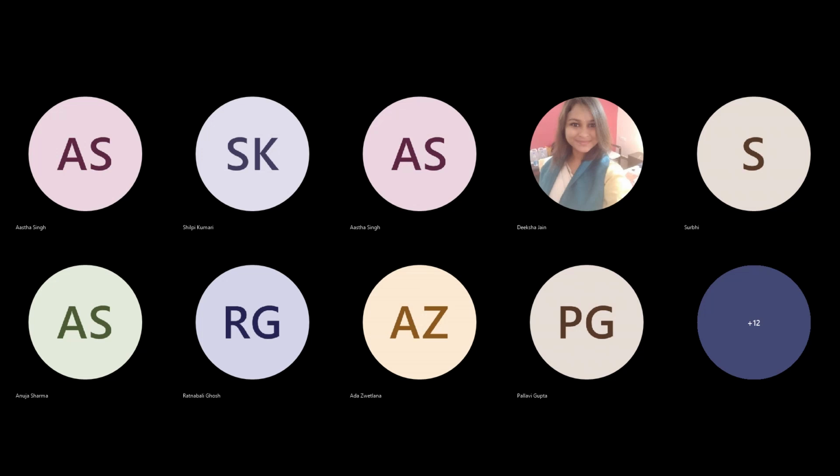The primer concentration, the probe concentration that you keep at 10,000, has to be kept the same. And the salt concentration, I think we keep 25 millimolar. Yeah, that is 25. That will also be kept the same. So we don't need to change any of those.